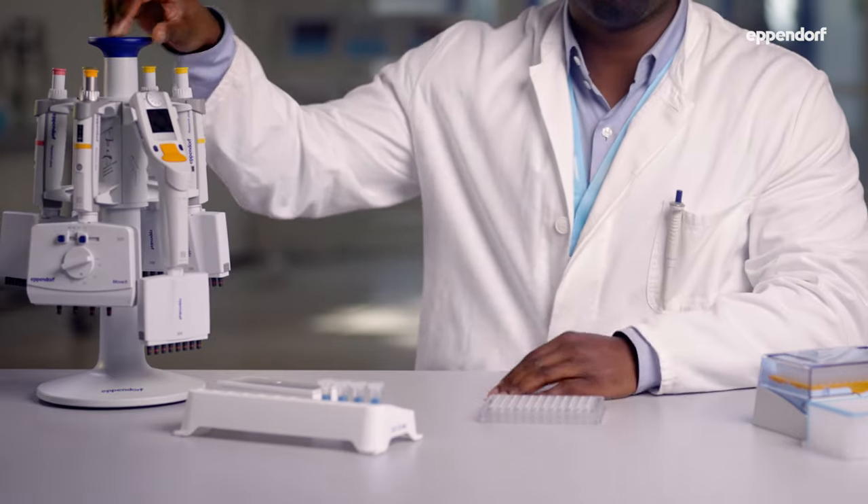The pipettes you can see on this carousel are Mechanical Research Plus pipettes, but they are also available as electronic pipettes too.